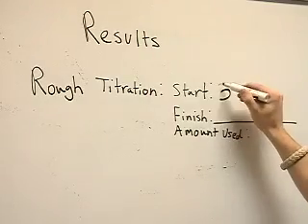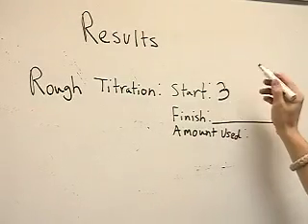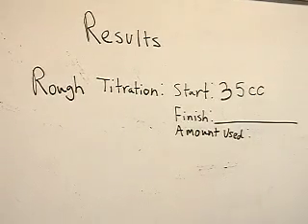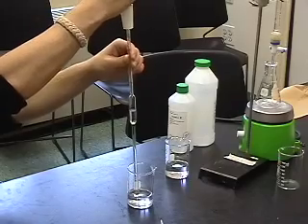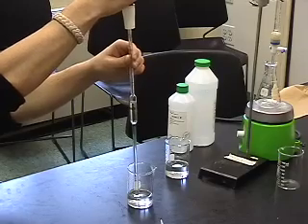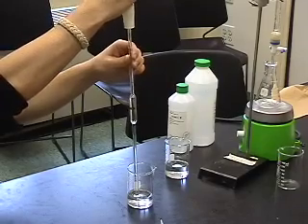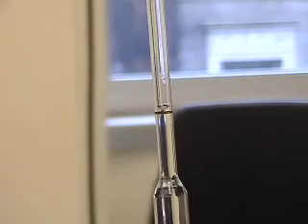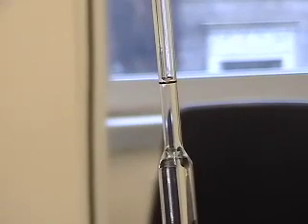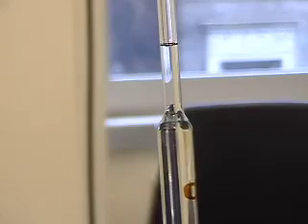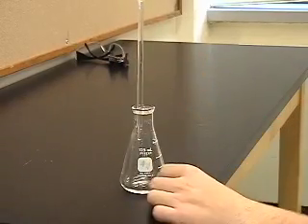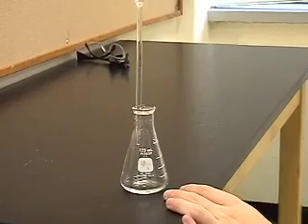You're then going to record how much acid is in your burette on your paper so that when you're done with all your titrations, you have all your results right in front of you. Now, you're going to fill up your pipette with exactly 10 milliliters of base. Make sure that the meniscus is right on the line so that you have exactly 10 milliliters of base and that your results are not skewed. Once you have the base, you put it into a flask.